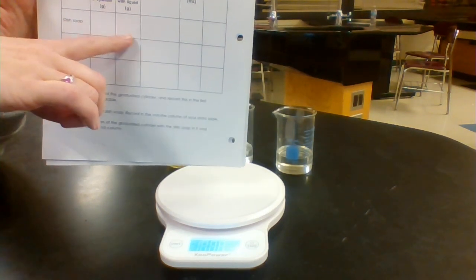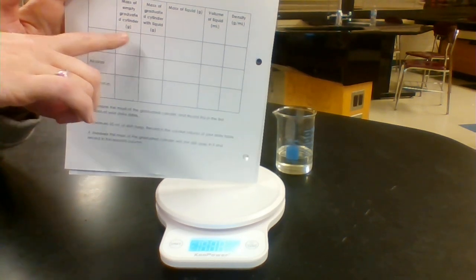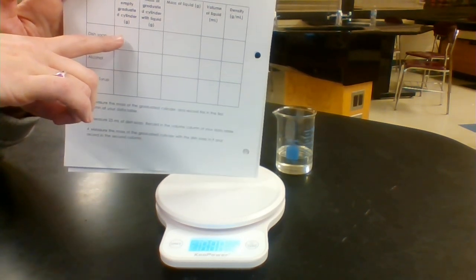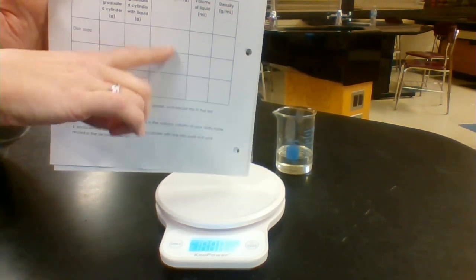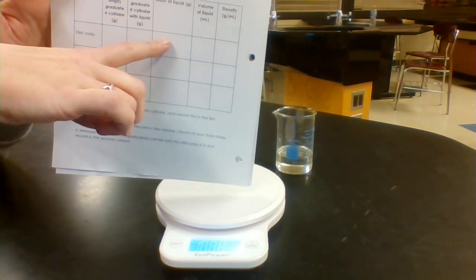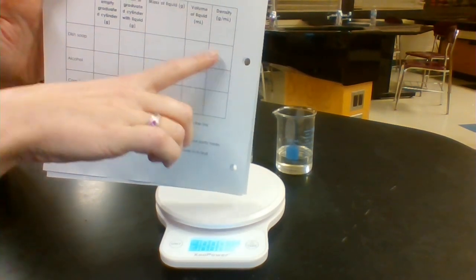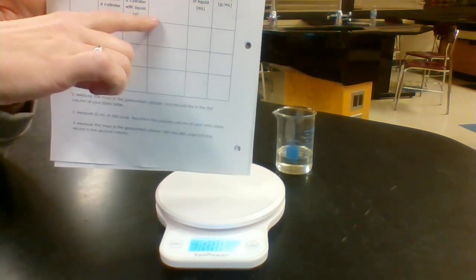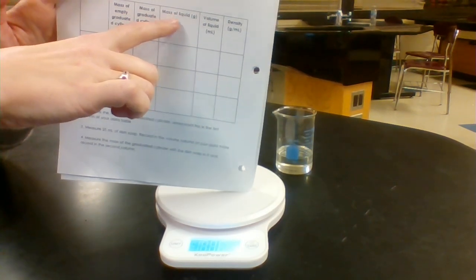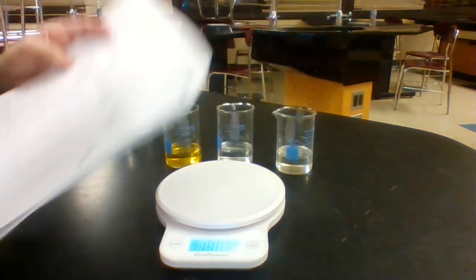So I need to take the mass of the container with the liquid, and I need to subtract the empty container, and that's going to give me the mass of just the liquid. Once I have the mass of just the liquid, I can use my equation, mass divided by volume, in order to get the density. So I'm going to take my mass, I'm going to divide it by my volume, and that is going to give me my density.